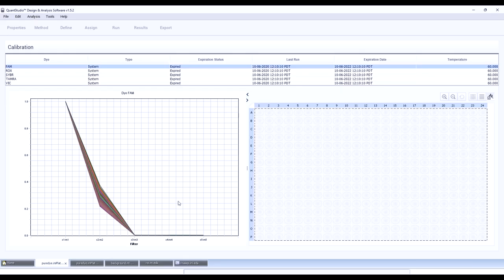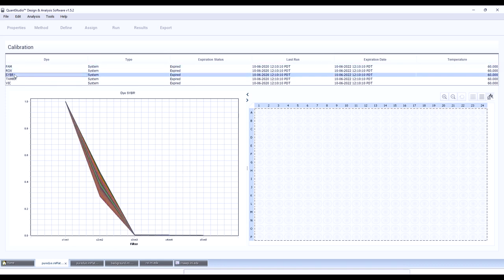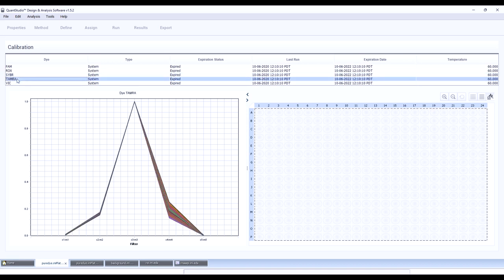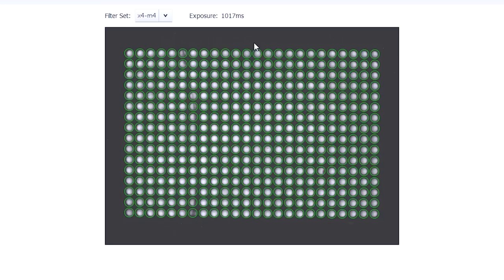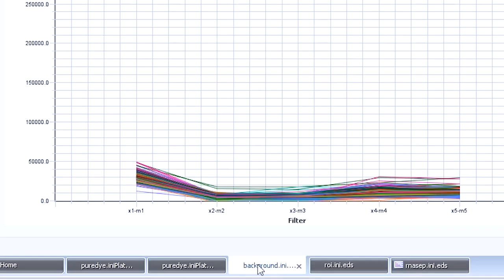This is what the dye calibration run file looks like when you transfer it over to the software. Here are the different filters and the different dyes — you can look at FAM, ROX, SYBR. What you're really looking for is a very tight band in these areas. If the bands look tight, you're in pretty good shape. You can also look at the ROI to see how well everything is lining up, and you can look at the background. Typically the calibrations last a couple of years, so it's not like you have to do it all the time.